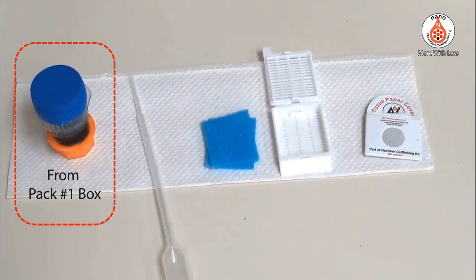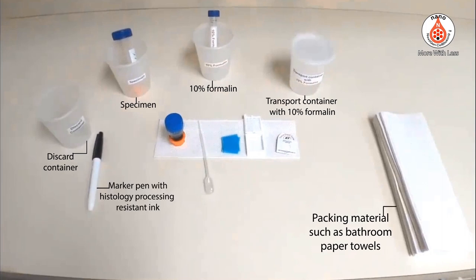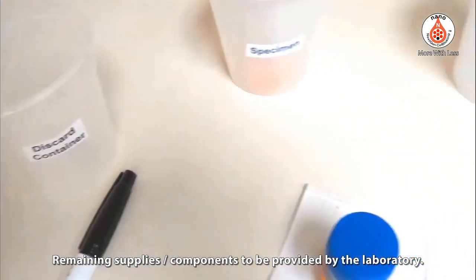The Nano unit comes from pack number 1 box, and additional items come from pack number 2 box. Remaining supplies or components are to be provided by the laboratory.